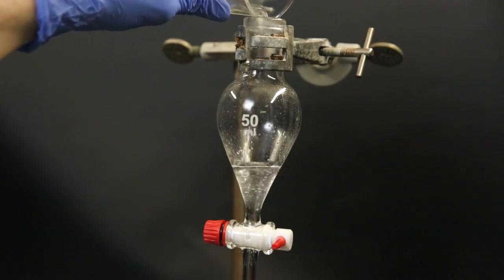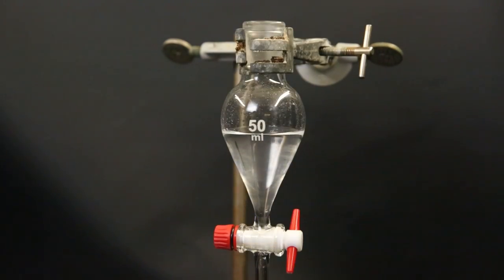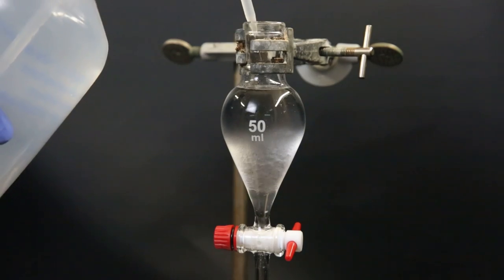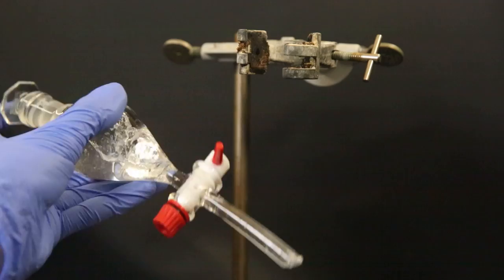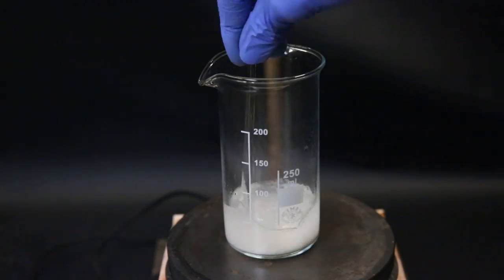I pour the water layer back in and extract it once more with some ether. I drain away the water layer and then pour the previous ether layer back into the sep funnel. Now I wash the ether layer with water and a 5% sodium carbonate solution. When that is done, I dry the ether layer with some anhydrous sodium sulfate.